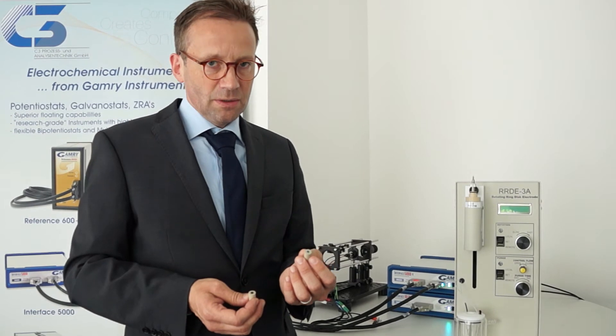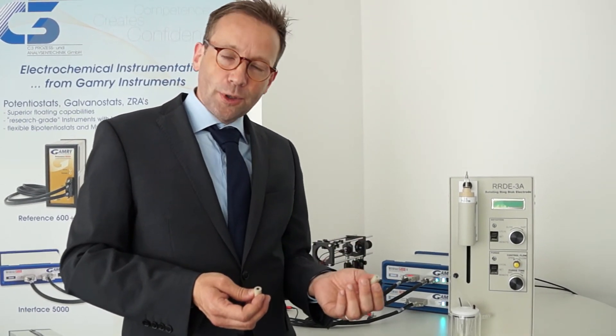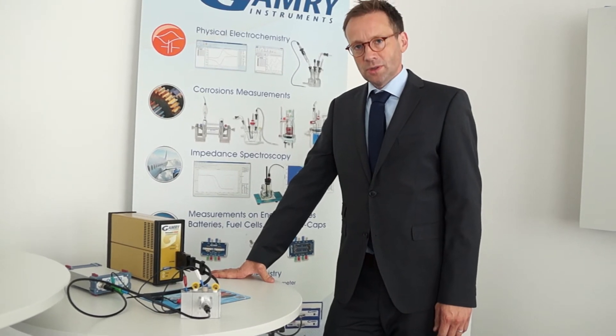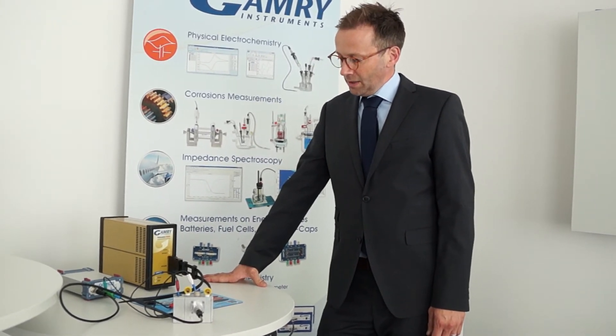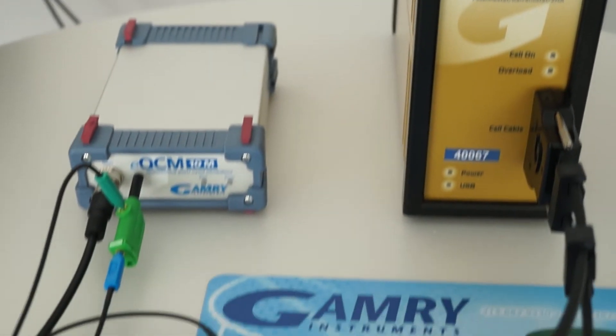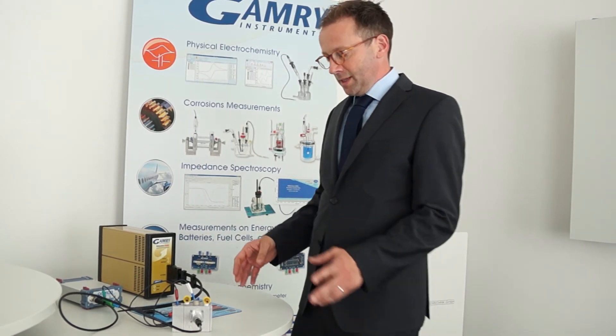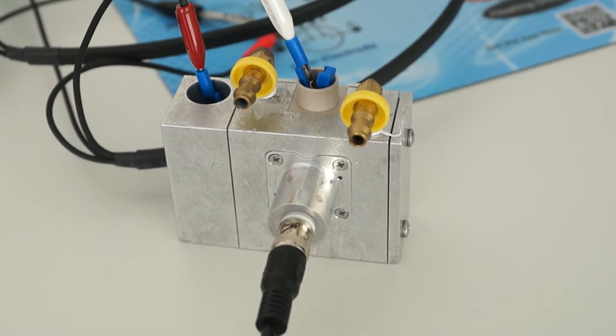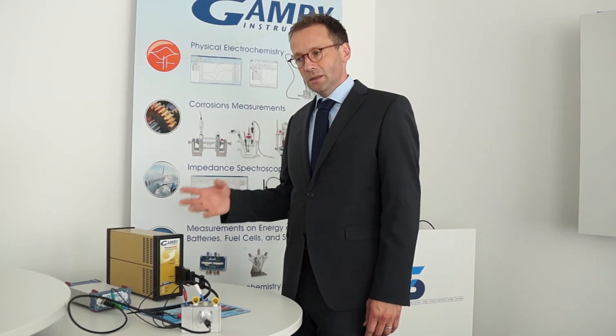So you don't interfere the measurements between the two working electrodes in the same electrolyte, which are electrically connected. Another rather unusual setup is this combined system of a GAMRY Reference 600+ potentiostat and the EQCM 10M quartz crystal microbalance, running simultaneously in combination with this cell, where you can assemble one half cell of your battery, cycle with your potentiostat, and at the same time study gravimetrically the lithium intercalation into your electrode in the microgram to nanogram range — so very sensitive and rapidly fast, allowing dynamic changes to be studied as well.